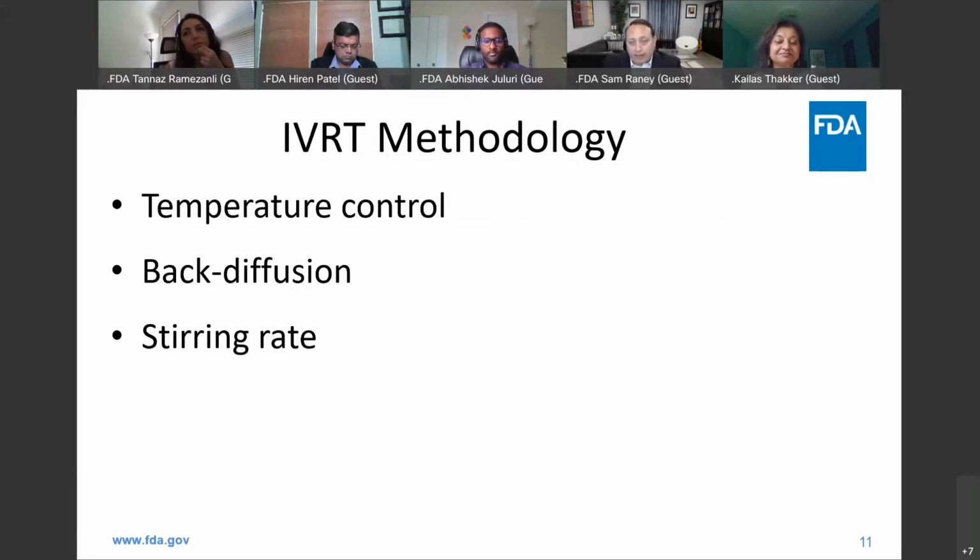It stirs well. We've validated on these conditions, and this is just the explanation for the stirring rate that's used. Or we have an apparatus that has this range of stirring rates, and we found that when the stirring rate went above such and such, then we started to actually see back diffusion, and therefore we developed the method to stay below that stirring rate. Just explain what your thinking was behind it. And that then prevents us from having to pull teeth, as it were, and ask you to explain by justifying these criteria.